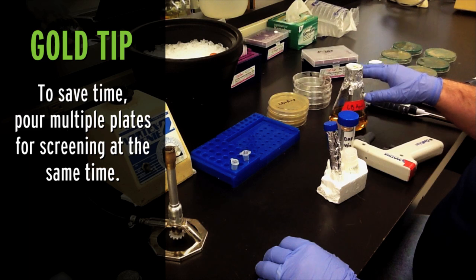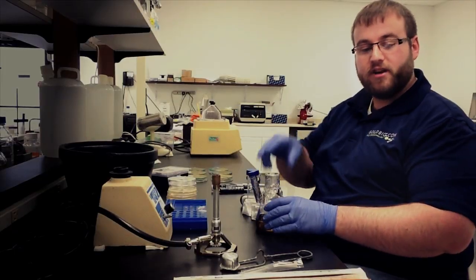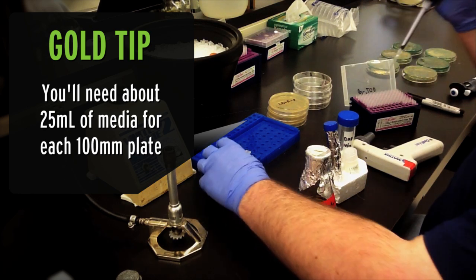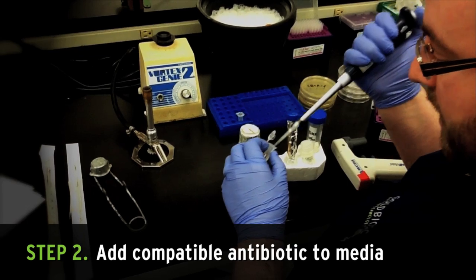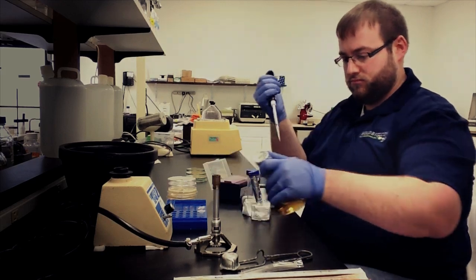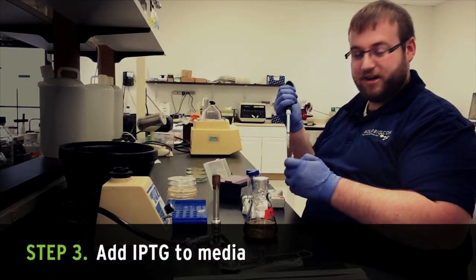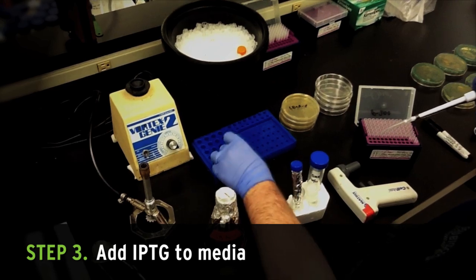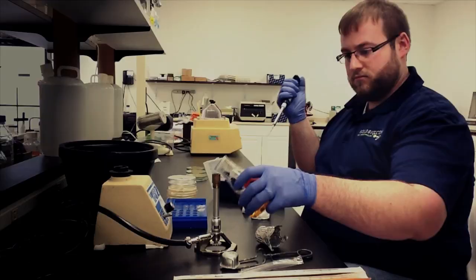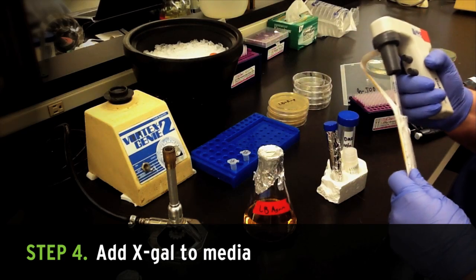To make multiple X-Gal IPTG plates for blue-white screening at once, start with autoclaved LB agar that's been cooled to around 50 degrees C. I typically estimate around 25 milliliters of media for each 100 millimeter plate that I need. First, add your antibiotic that's compatible with your plasmid and cell line. Next, add 1 microliter of 100 millimolar IPTG per milliliter of media. Then add 10 microliters of 20 mg per ml X-Gal per ml of media.